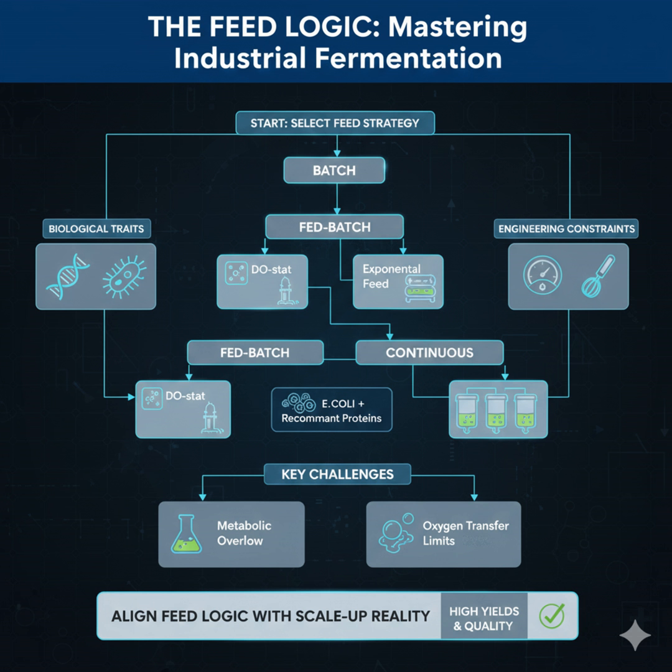It has to be. And the final piece of the biological puzzle is the process type itself. Are we talking aerobic, microaerobic, or anaerobic? And aerobic processes are inherently the most challenging. They just are. Why is that? Because they become constrained by physics very, very quickly. At scale, the ability to transfer oxygen from the gas bubbles into the liquid broth, what we call kLa, that is the ultimate bottleneck. Yeah. And since feeding directly dictates the cell's oxygen uptake rate, or OUR, these aerobic processes are just exquisitely sensitive to the feeding strategy. The feed rate becomes synonymous with the OUR.